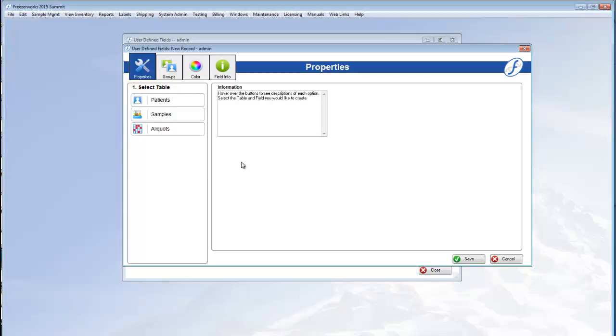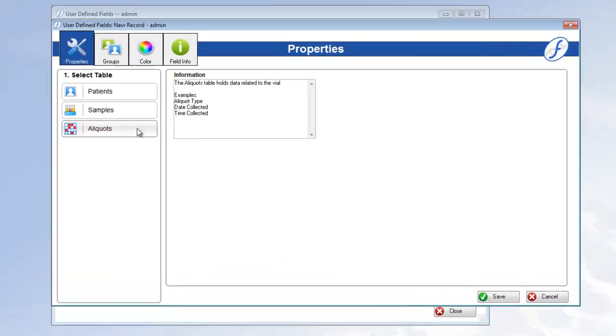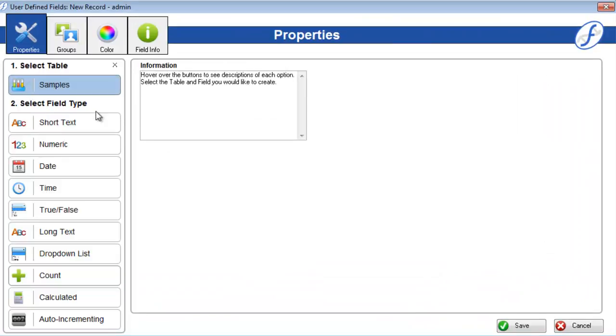The first step to creating a user-defined field is selecting the table that the field will associate with. Hover over each button to see information about the tables in the adjacent box. Once you select a table, the ten different field types will appear.